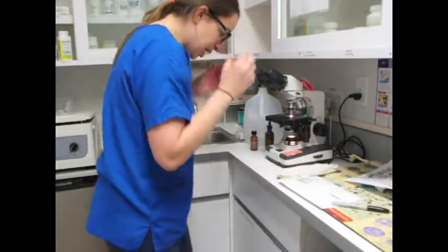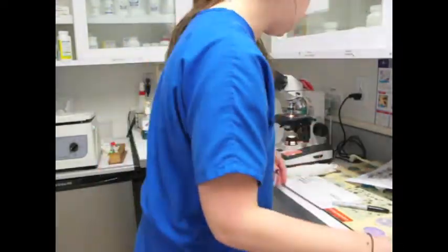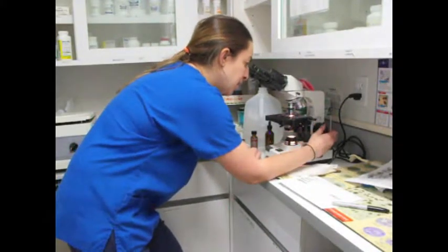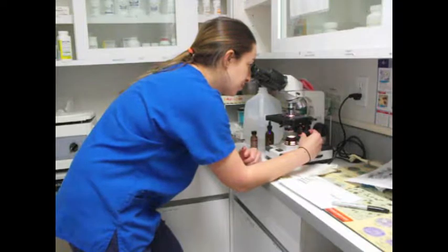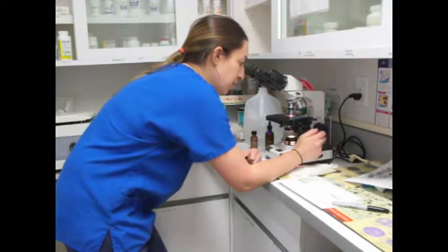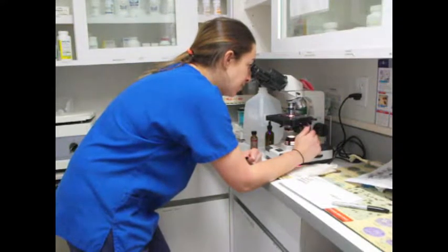So I'm going to begin, and I'm going to take a tally. So let me find a good field. Okay. So I'm in a field on the oil immersion lens.